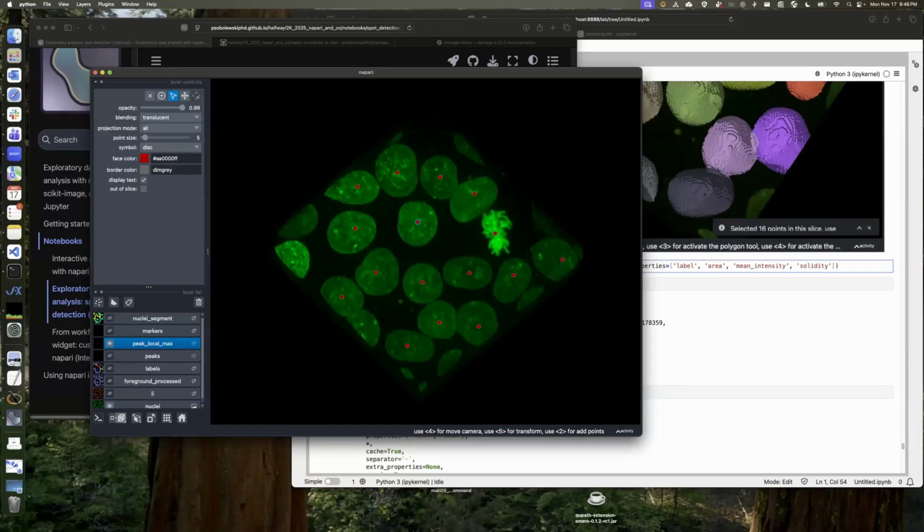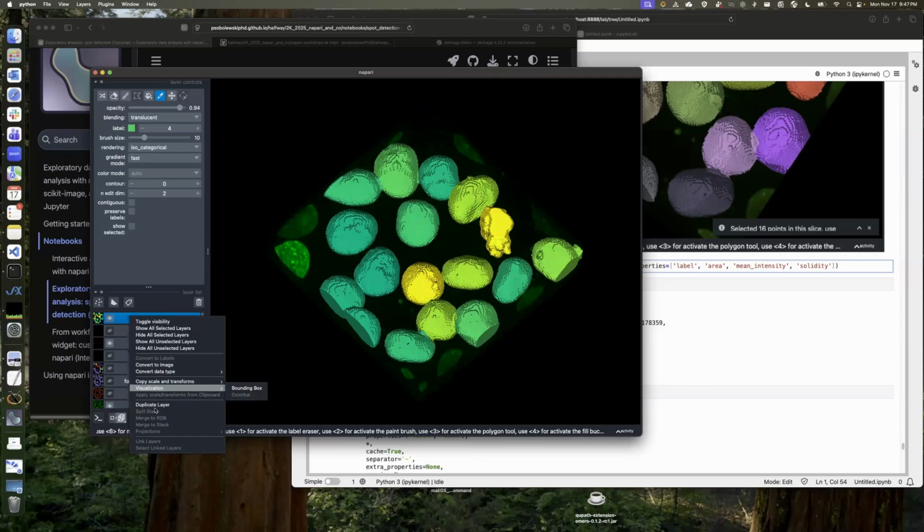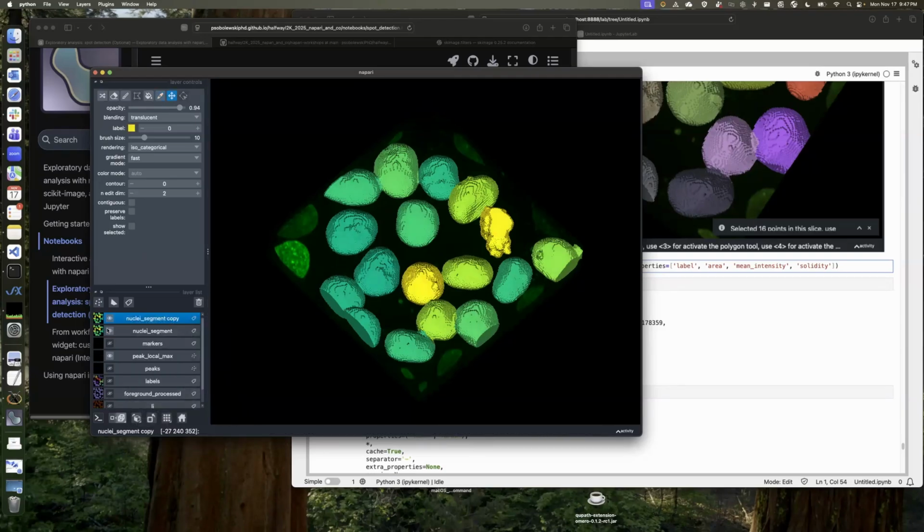Niels, your question about, yeah, let's see here. So to modify a previous selection, for example, Miriam, what do you mean by previous selection? Oh, you mean like if you wanted to modify like this? Okay, so you can actually do this in 3D. The paintbrush and the eraser tool work in 3D. I'm going to just show this real quick. I'm going to duplicate this layer.